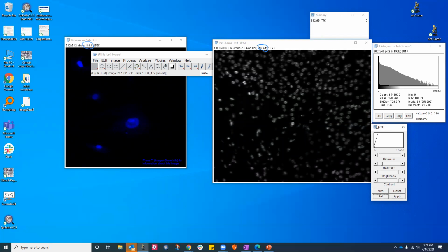So what we are doing with brightness contrast is we are decreasing our maxima to display the pixels which are right in this range to be displayed better. We are ignoring all the pixels which are in this range, so we are completely ignoring all of them.